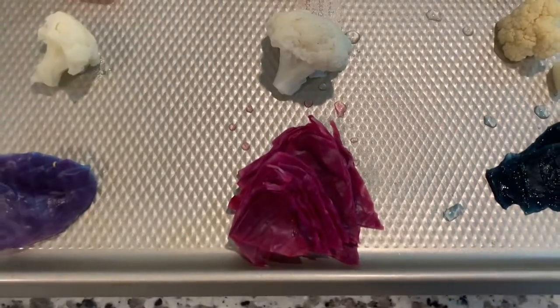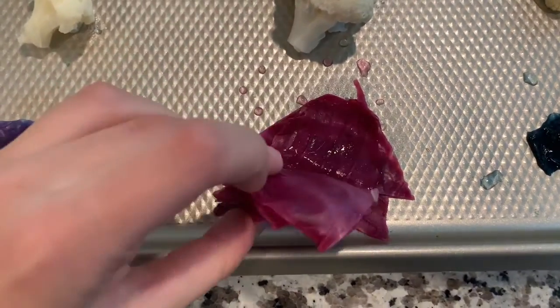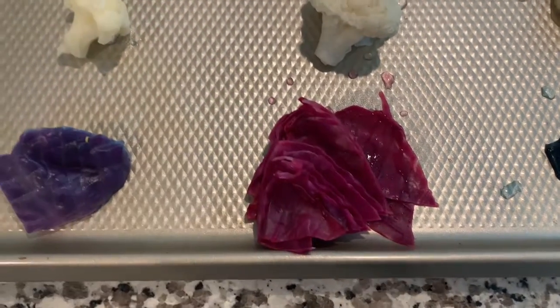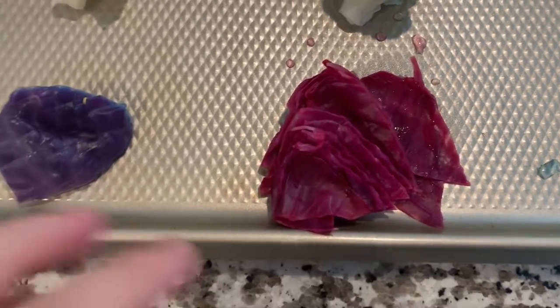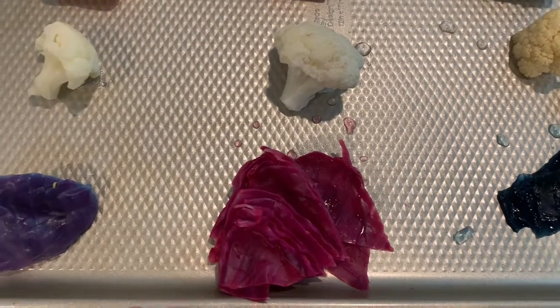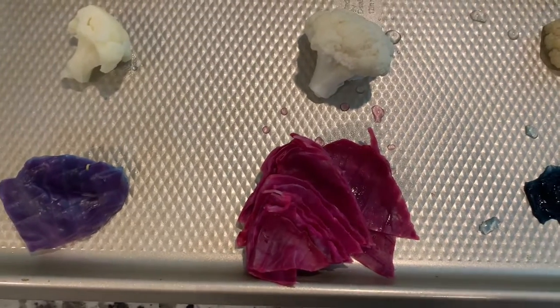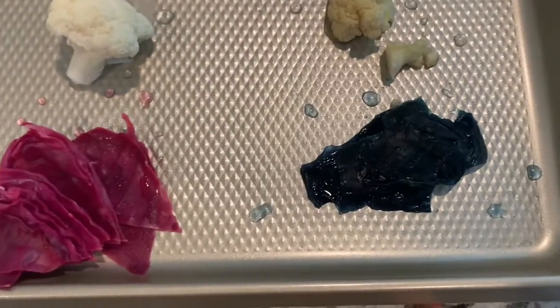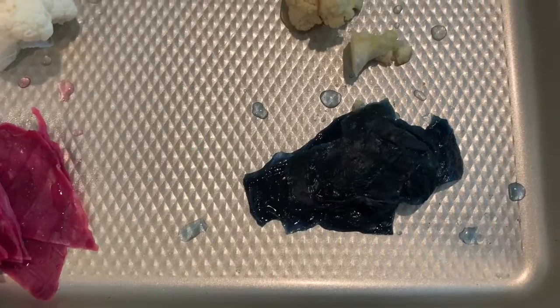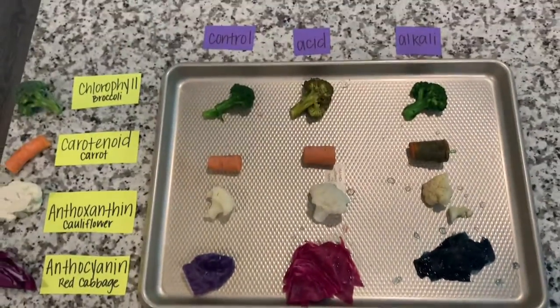Then we're gonna move on to the acid. Beautiful red color. I mean, it's very pretty. Pink is my favorite color, so this one was my favorite. And I included a little bit of the water that we talked about in the lecture. So the water becomes this red pink color, and then with the alkali base solution, it becomes a blue purple color. So those are the results for my vegetable lab.